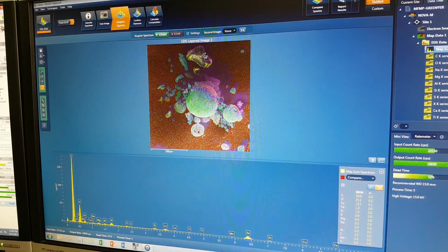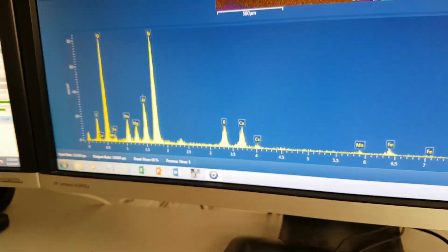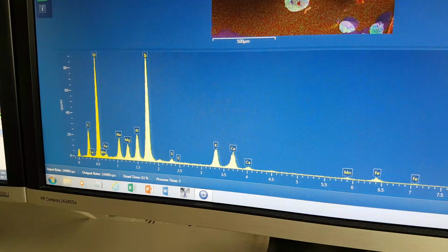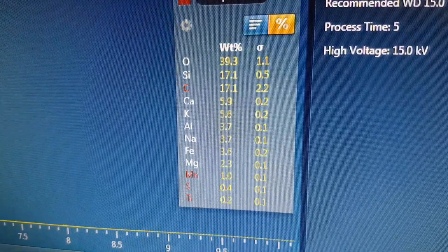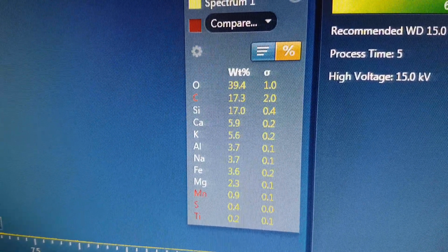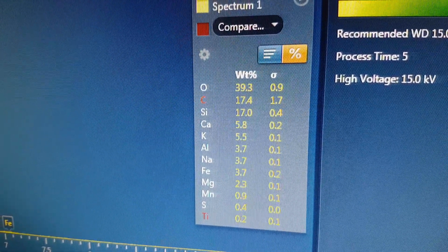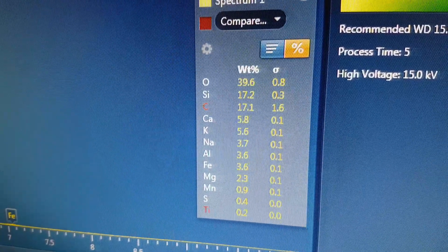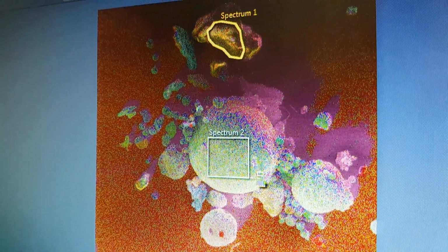Oh, you're getting good at that. So Jana here is drawing around this silvery, yellowy blob here we've got, and we'll see what concentration is. Yeah, why not? So this one looks like it's silicon. Okay, so we've got much higher concentrations here in this second one of silicon, calcium, potassium. Because the silicon could be coming from the quartz, we have to bear that in mind. The quartz resonator obviously has silicon in it. So let's see what that comes out. So the iron's much lower concentration in that. Let's see what spectrum 2 comes out as when we look at that.